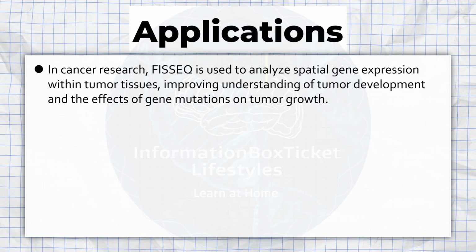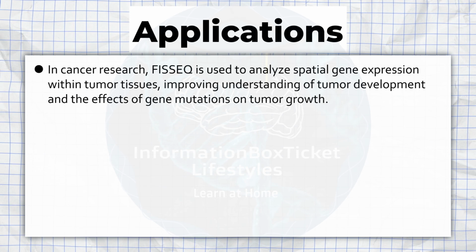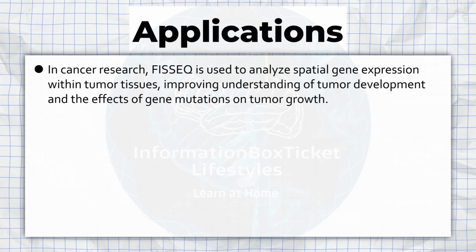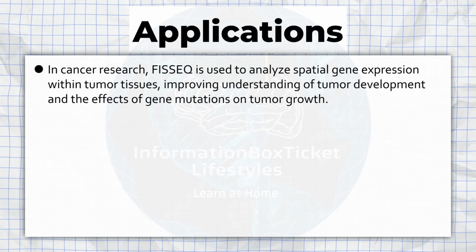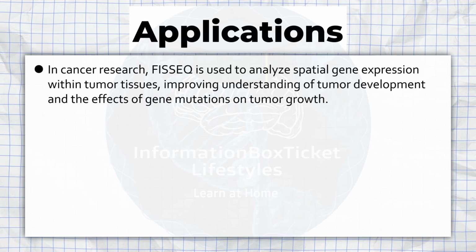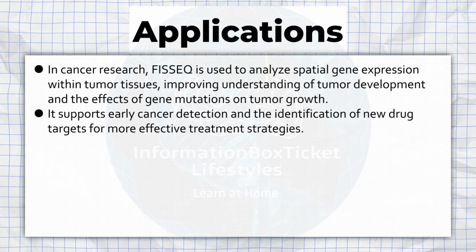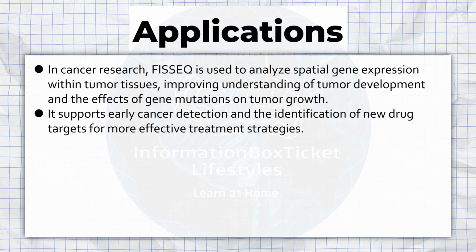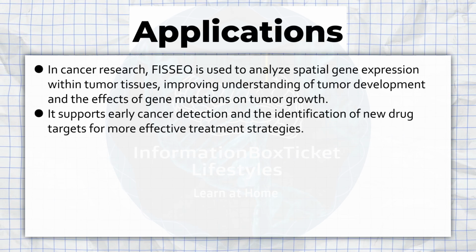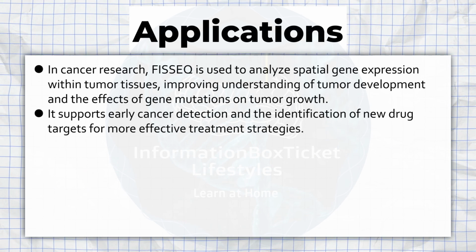In cancer research, fluorescent in situ sequencing is used to analyze spatial gene expression within tumor tissues, improving understanding of tumor development and the effects of gene mutations on tumor growth. It supports early cancer detection and the identification of new drug targets for more effective treatment strategies.